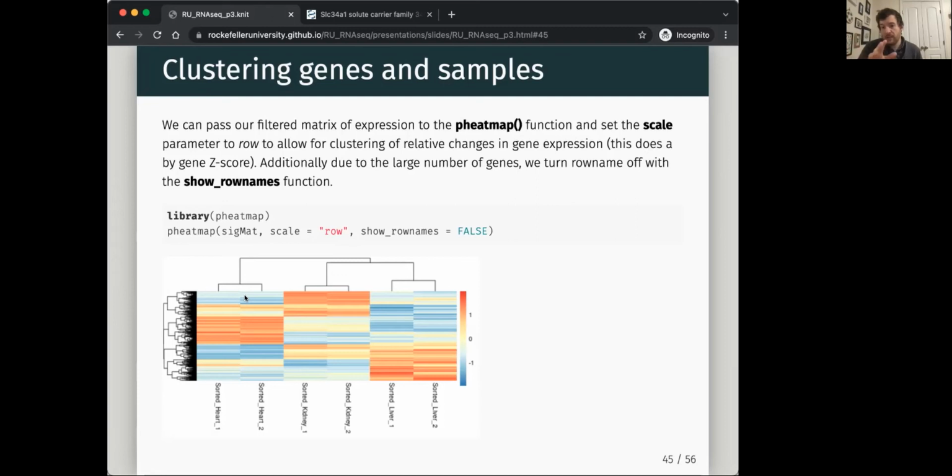So in these three genes where you have 1,000, 110, they might all get upregulated in kidney. But unless you do something to normalize to the levels, you can't tell that they're actually behaving very similarly. And so by doing a z-score analysis on a per gene level, it allows you to just focus on trends and not absolute values.